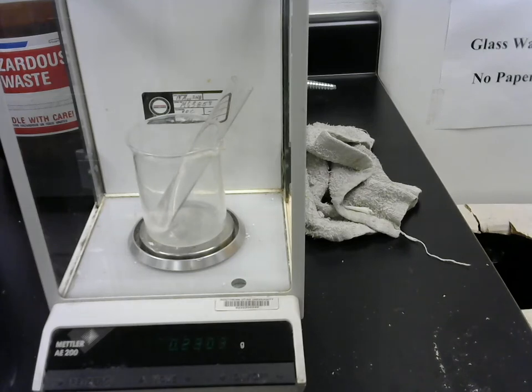Maybe 0.230. So a slight discrepancy from what we weighed out before. We'll go ahead and use this number. Oh, I don't know, now it's climbing back up. 0.233. Anyway, that'll give you 3 sig figs at least of the actual amount of naphthalene delivered to the cyclohexane. Now we have a mass of cyclohexane, a mass of naphthalene. We can use those to determine the molal concentration of this solution.